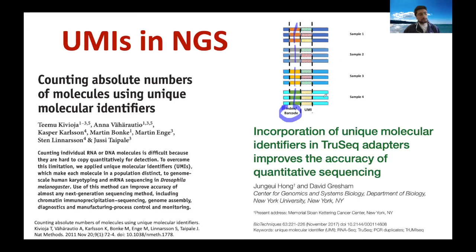Remember when we discussed the UMIs yesterday, the UMI sequence is not sufficient to say this is a PCR duplicate. We usually use two pieces of information, the mapping location and the UMI sequence. So I cannot say that these three reads, since they have the same UMI, are coming from the same original molecule, and so they're only PCR duplicates.